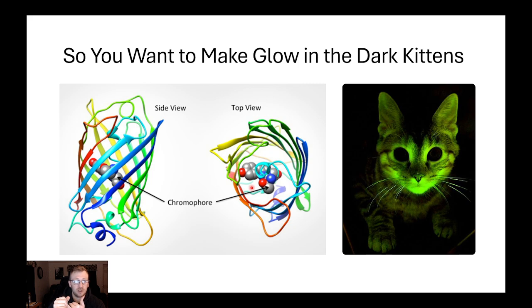So if you're interested in looking at temporal resolution of certain proteins, this is a really great way to see it. If a protein is only expressed in interphase, we can see it expressed in interphase by conjugating it to a fluorescent molecule, and then we're able to know it's only active during interphase, but it goes away during mitosis.